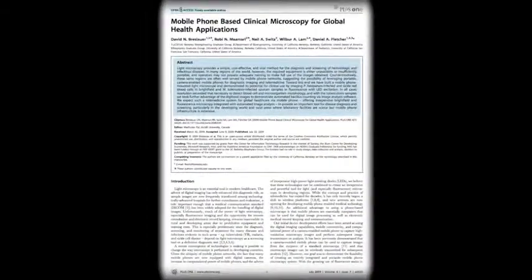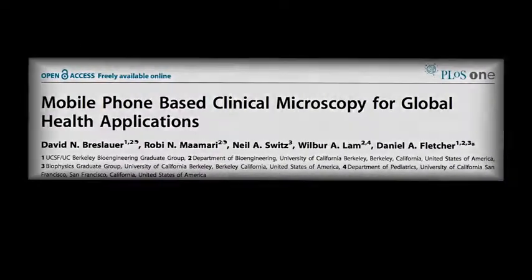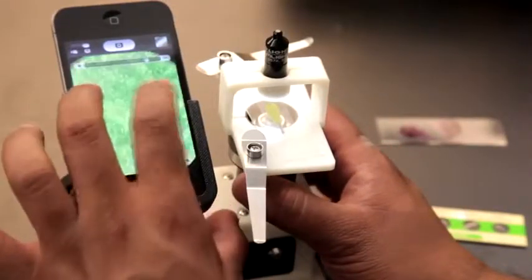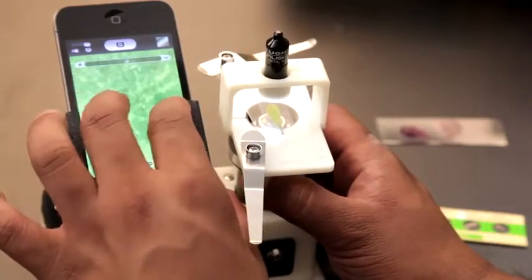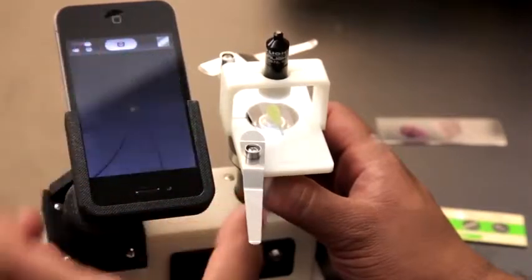I read the journal article, which was publicly available, which was very helpful. I saw what they had originally intended for it. Disease detection, and to identify diseases such as malaria and tuberculosis, TB, it's imperative to get a good look at the blood and look at the blood cells.